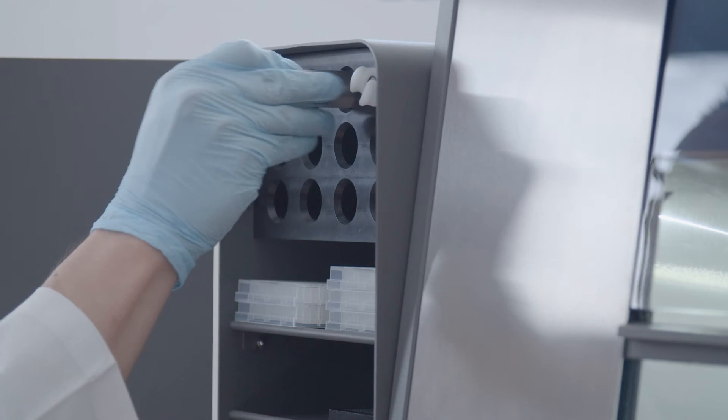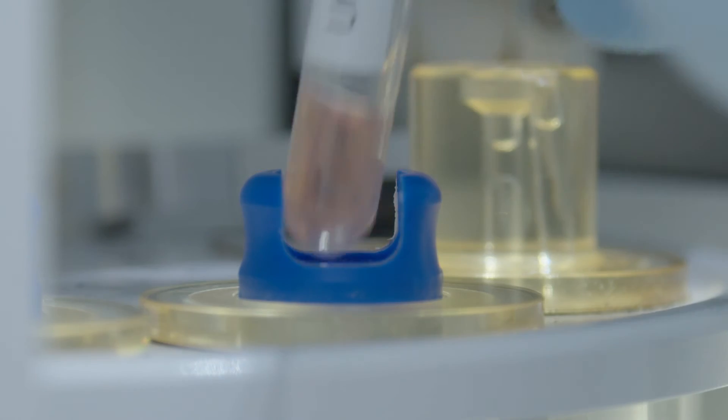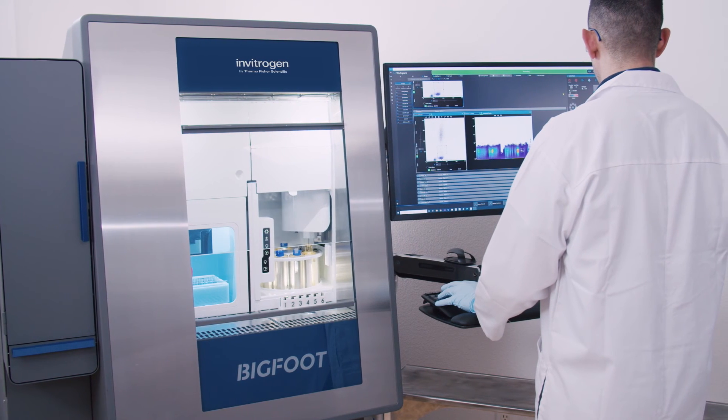The InvitraGen Bigfoot Spectral Cell Sorter class 2 biocontainment cabinet provides safety and protection without compromising high-parameter sorter performance or limiting serviceability.